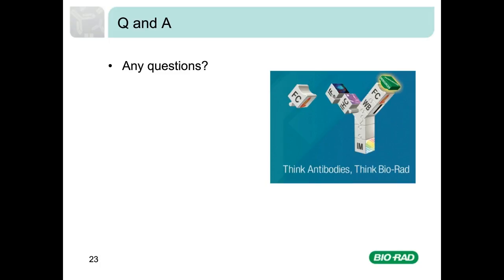So always ensure that you use true single-stain tubes for setting up compensation. If you're using cells rather than beads for the single colours, then this means you must exclude the viability stain from these tubes.